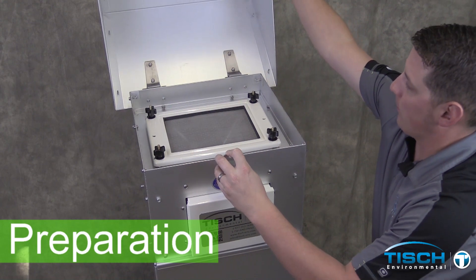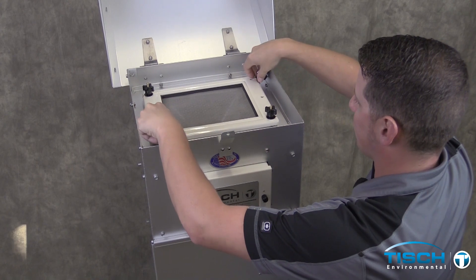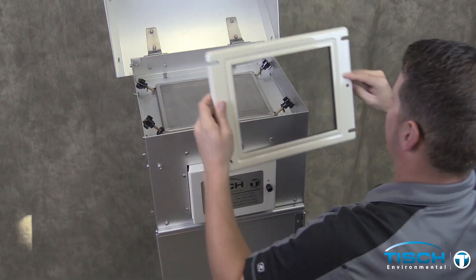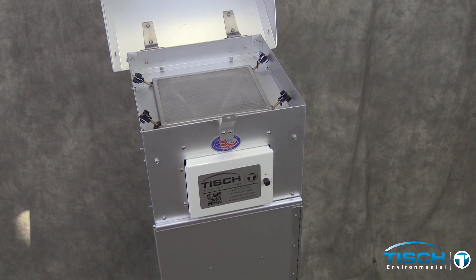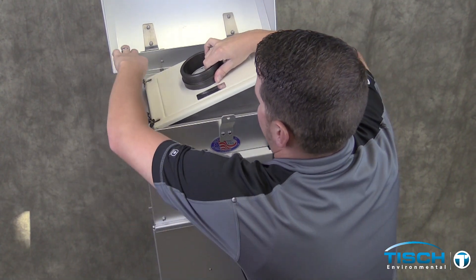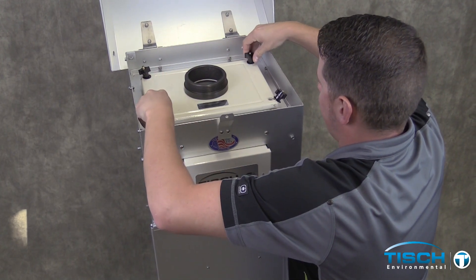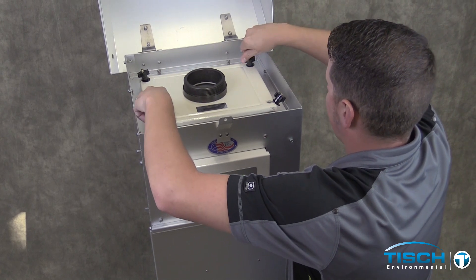Open the lid, loosen the four plastic nuts, and remove the frame. Install the TE-5035 top-loading adapter plate. Make sure that the plastic washers are on top. Snug the plastic nuts down onto the frame.